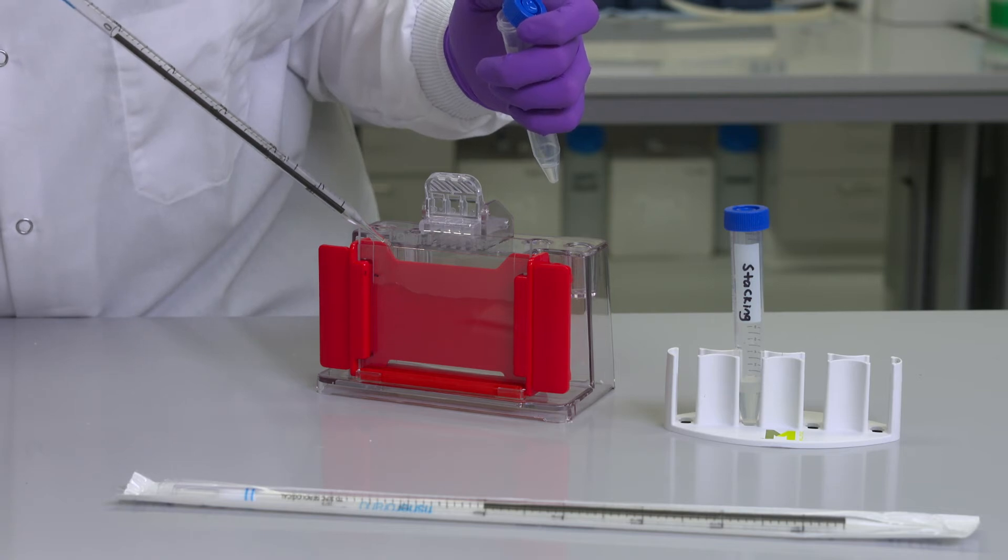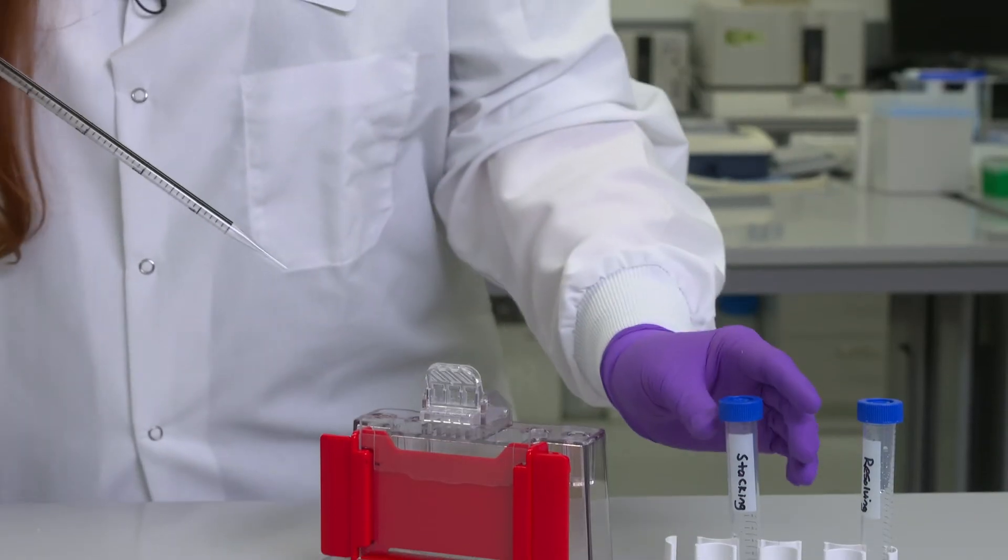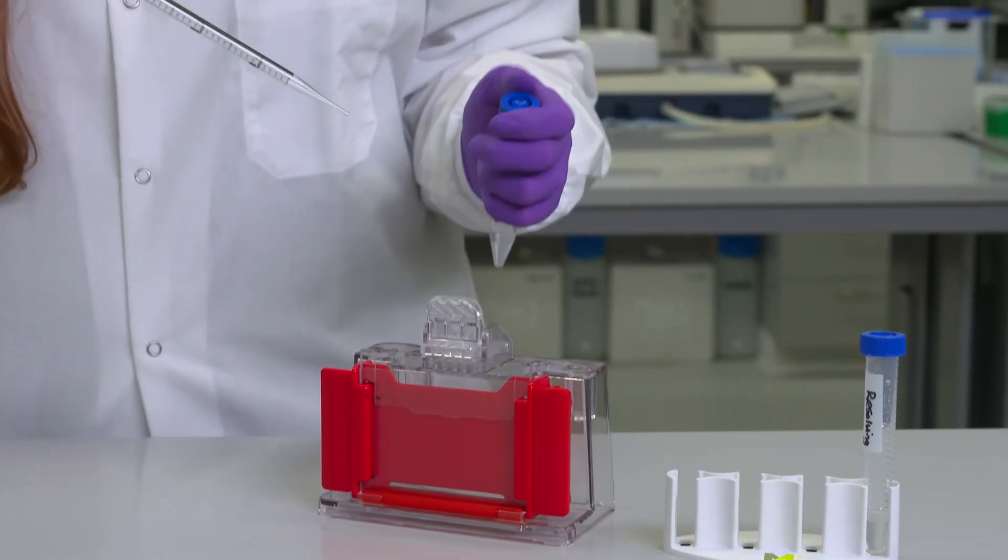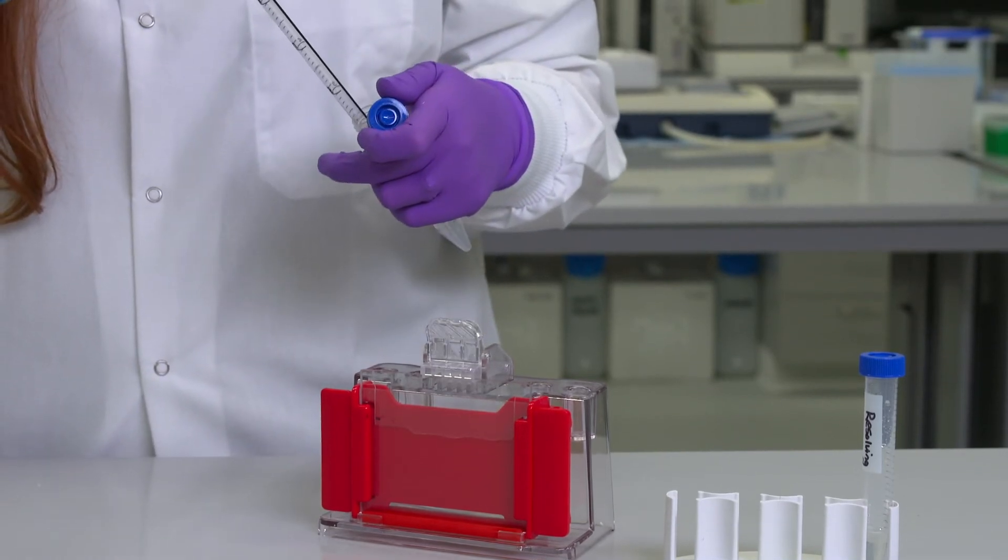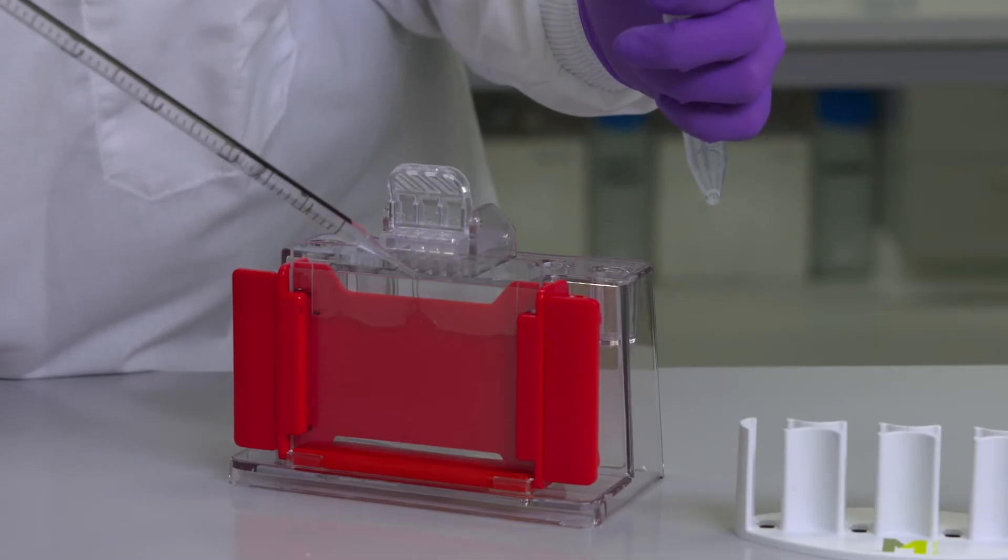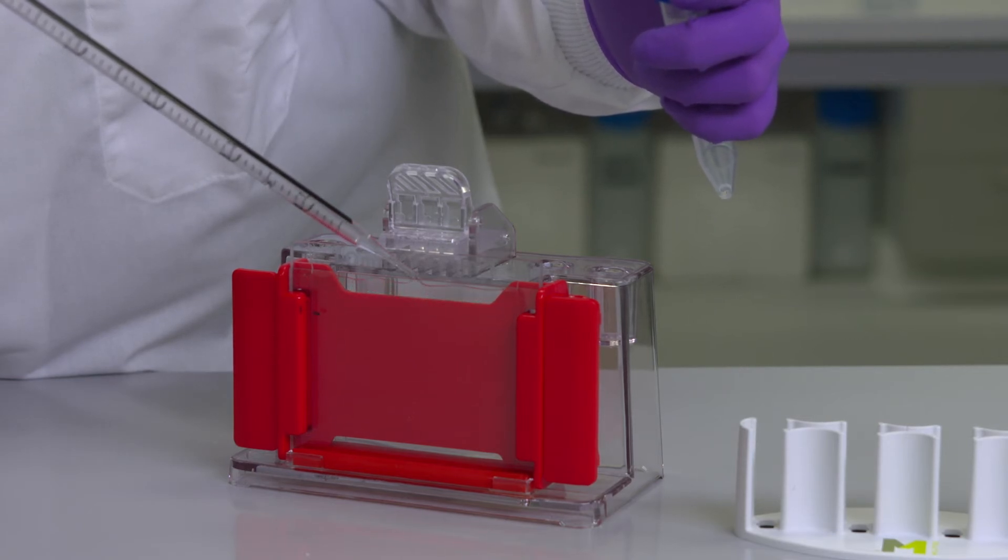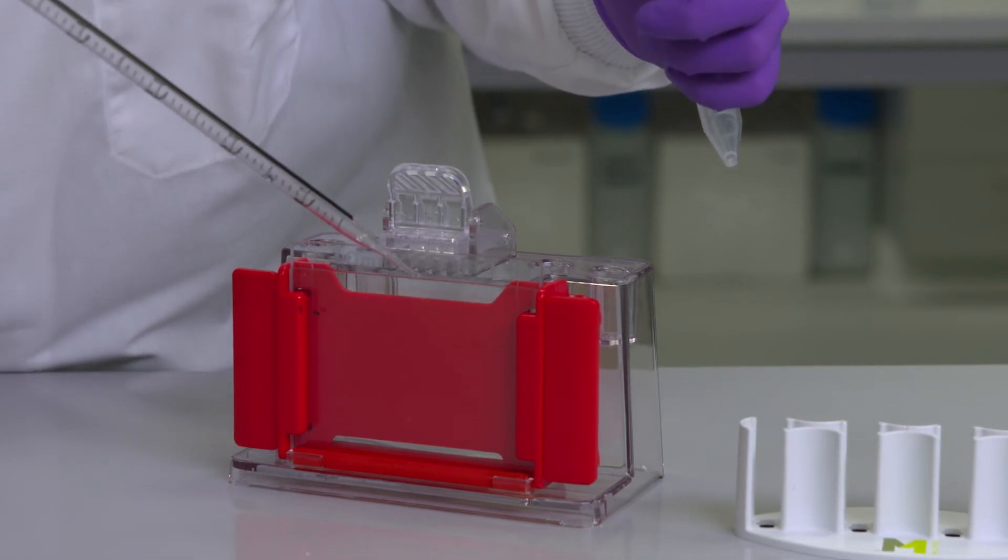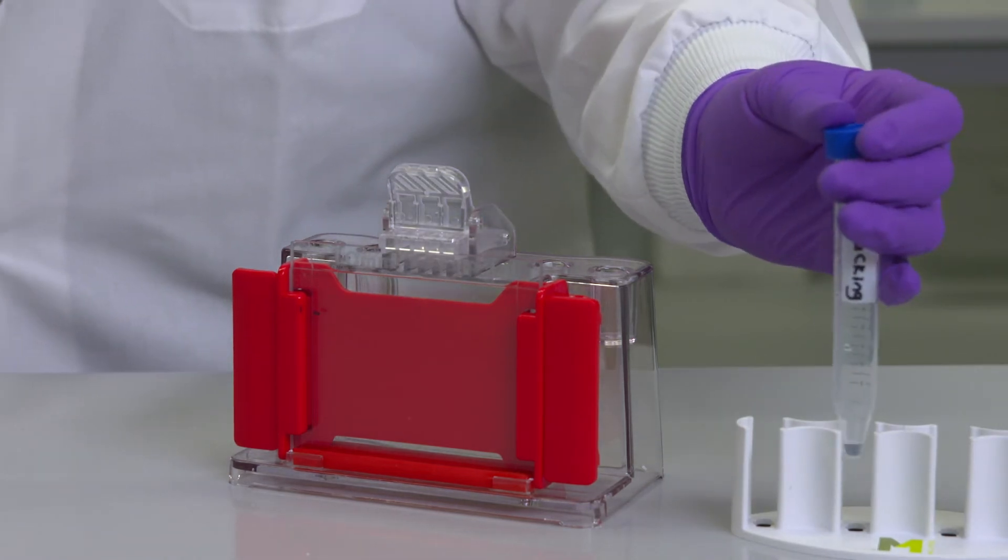The stacking gel can be added directly on top of the resolving gel without waiting for polymerization. You may see a dip form where pipetting takes place and this will level out over time. Add enough stacking gel to reach the top of your cassette and this will prevent bubble formation around the comb teeth.